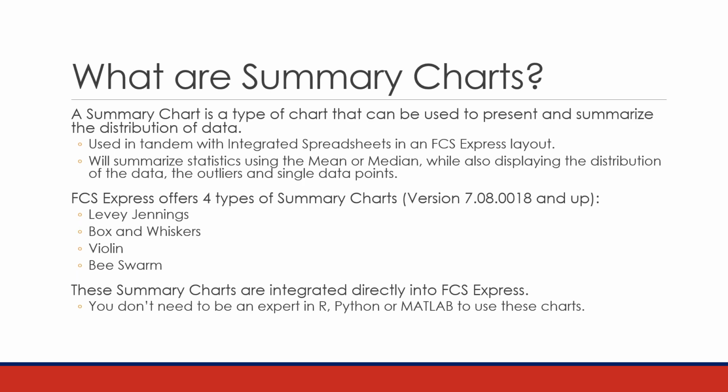We have the ability to use Box and Whisker plots, which we've had for a while, but it made sense to present them all together with these other releases. Violin and Beeswarm plots are also new to this release. Typically these are charts that people would have used other software to represent data graphically.